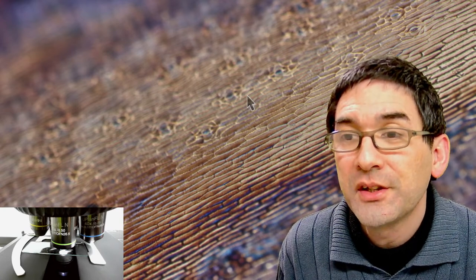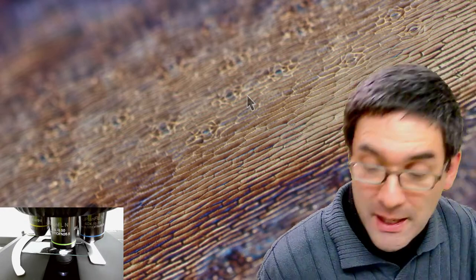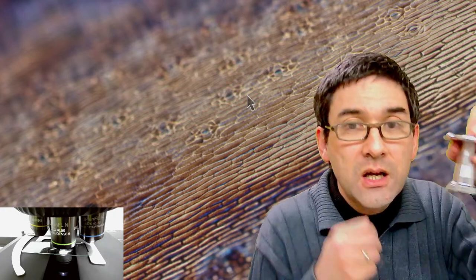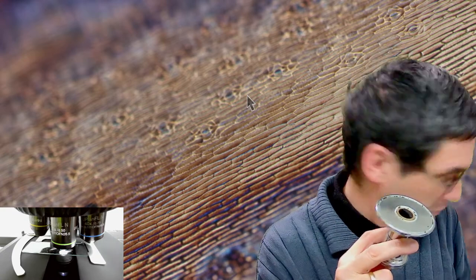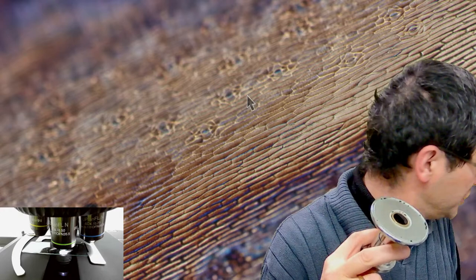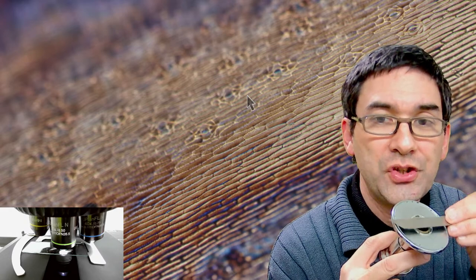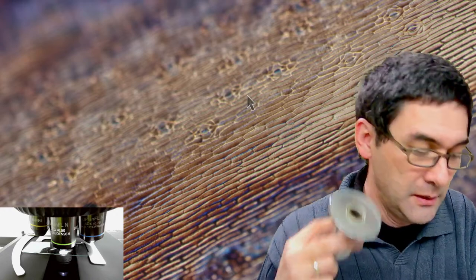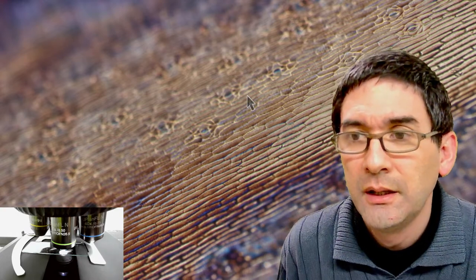What is a microtome? I've got one over here which allows you to make very thin cuts. You put a sample in here and then you can use a knife and cut across here — this allows you to make very, very thin cuts. That is a microtome. I was not so happy with this one, not with the microtome itself but actually my knife is kind of dull.